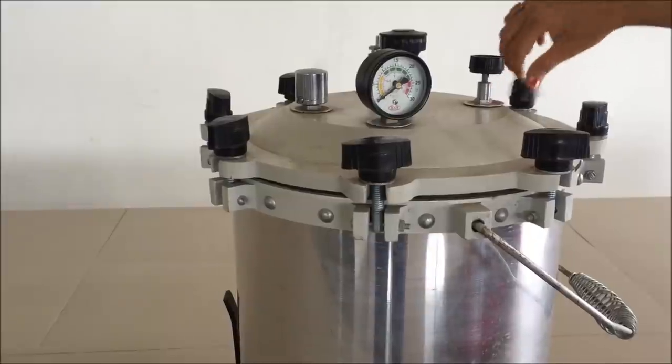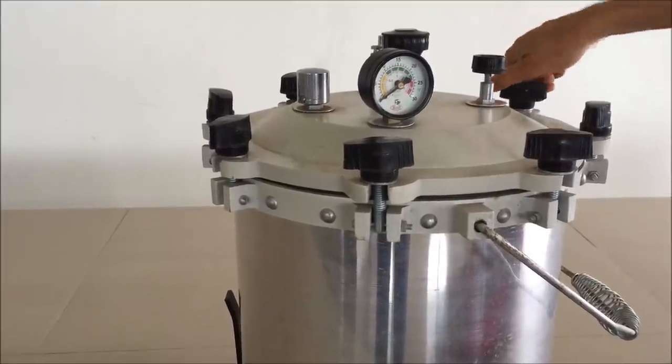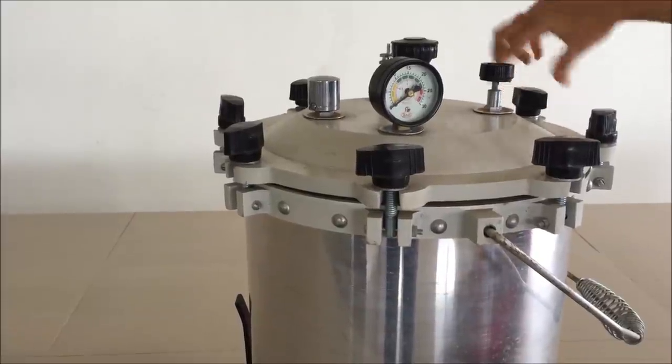The safety of autoclave very much depends upon the screws. If you tighten it properly, that will be safe for use.